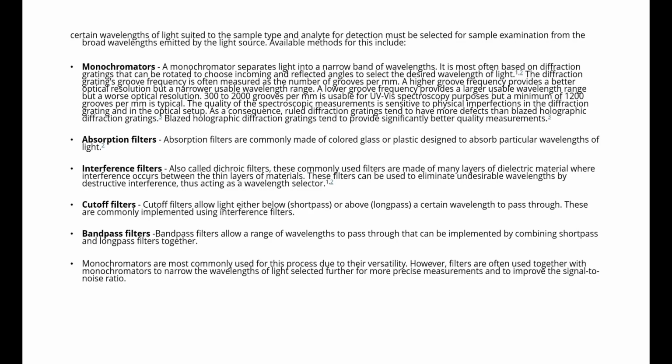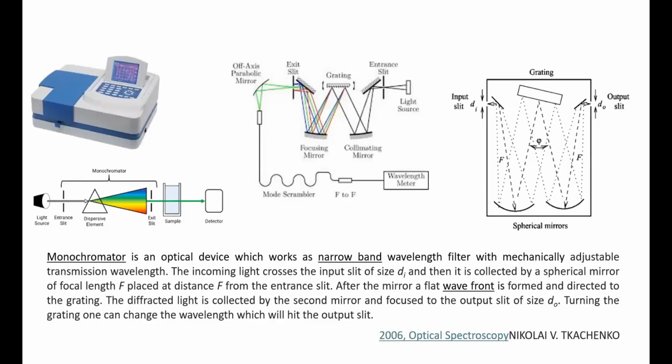So let's talk about the design of the instrument. When we talk about the UV visible spectrophotometer, the monochromators are the important component, right? When I say monochromator, what comes to your mind? This is the design of the instrument. The leftmost block design in blue is the tabletop UV visible spectrophotometer.